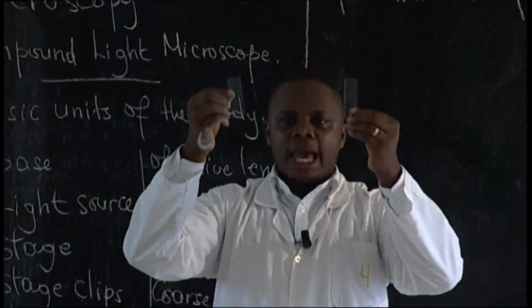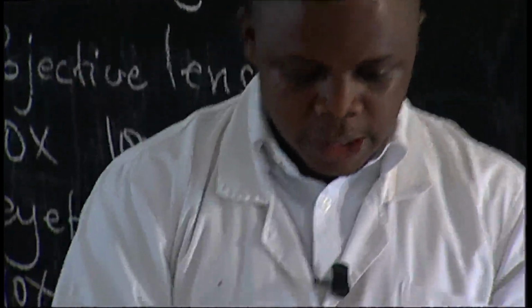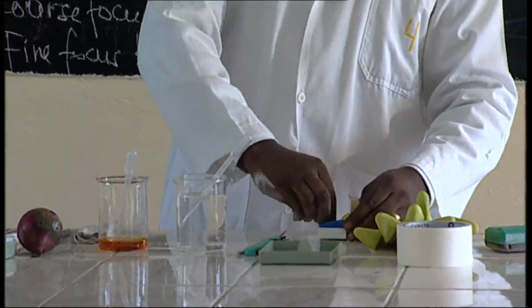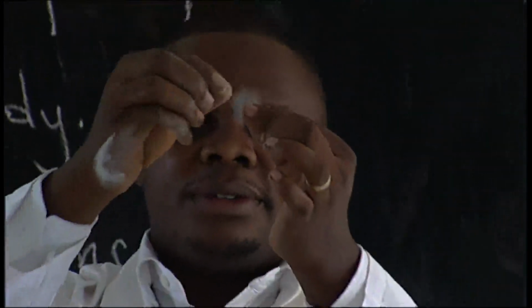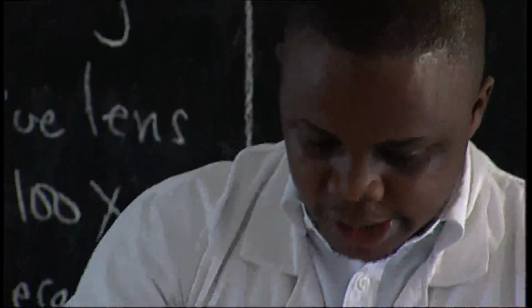You can see on these slides there is no sample or any prepared specimen. Then I also have these, which are very small. These are called cover slides.